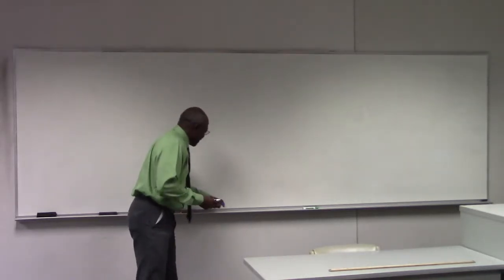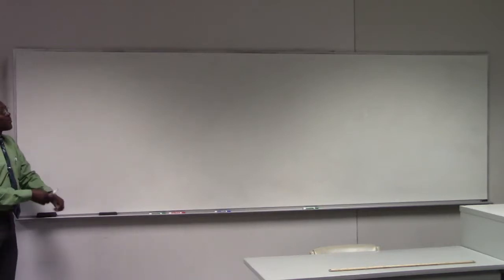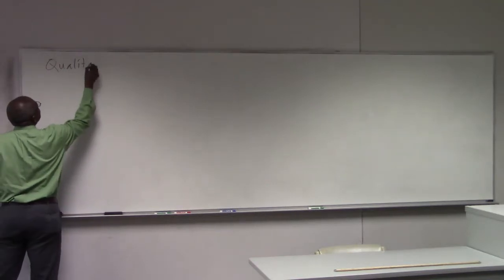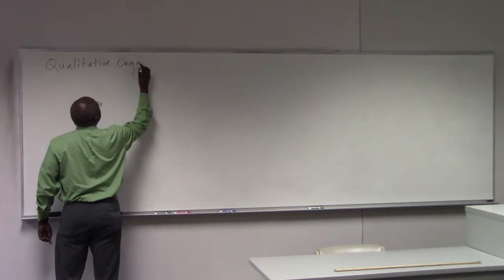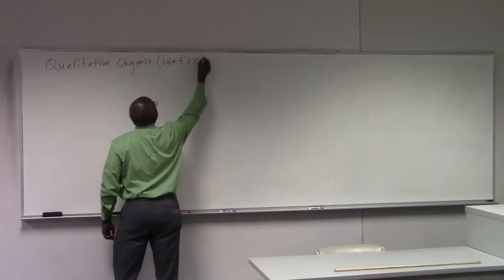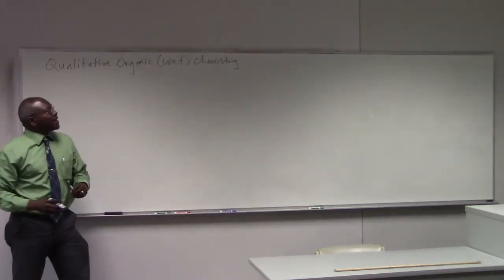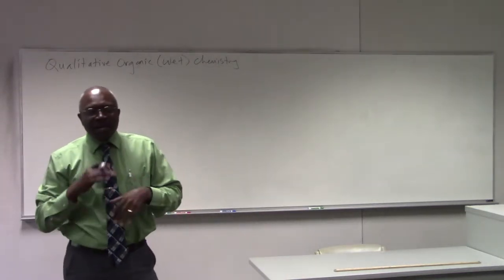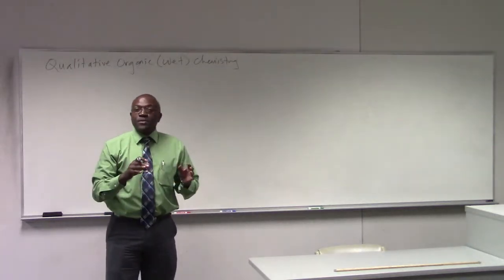Right, thank you. Okay, so we want to look at qualitative organic chemistry. And some people call this wet chemistry, because we'll be using a bunch of reagents to try to identify the presence or absence of certain functional groups in organic compounds.